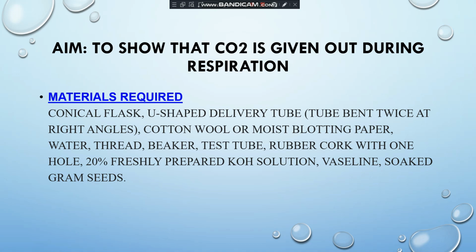The materials required are one conical flask, U-shaped delivery tube, cotton wool, thread, beaker, test tube, water, rubber cork, and freshly prepared KOH solution. KOH means potassium hydroxide solution, Vaseline, and germinated seeds. Okay, so these are the materials required to perform this practical.